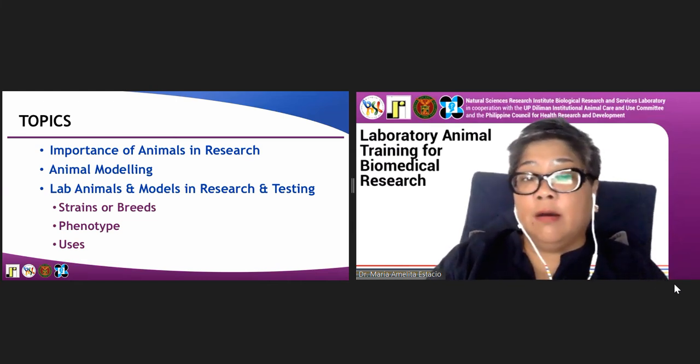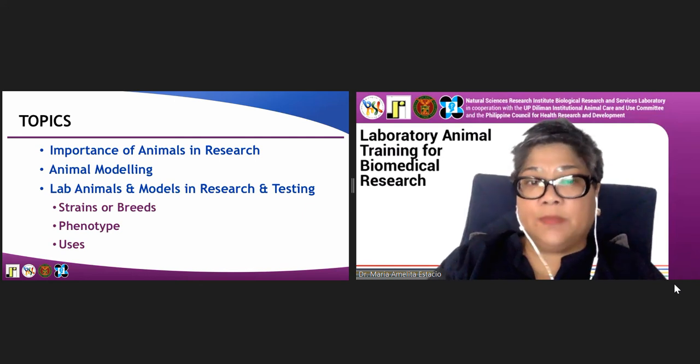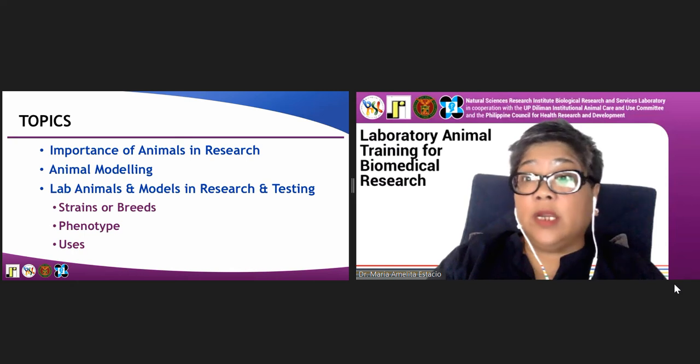I'll be touching on the specific strains or breeds for larger animals. What are the specific characteristics or phenotypes of these laboratory animals or models? And what are the specific uses in research?